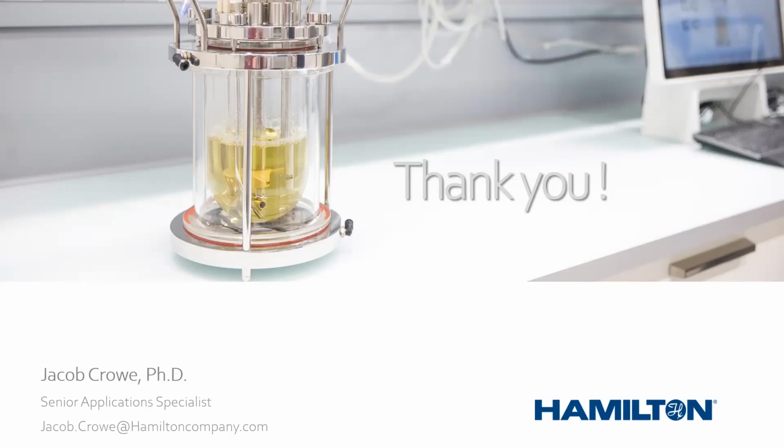Sampling a bioreactor for offline measurements is invasive and leads to smaller pools of data compared to PAT sensors. Besides the applications you have shown, have you seen examples where cell growth kinetics or cell growth parameters would be significantly different between the two approaches, offline versus online cell concentration, leading to differences in process conditions and target product productivity? So that's a full question.